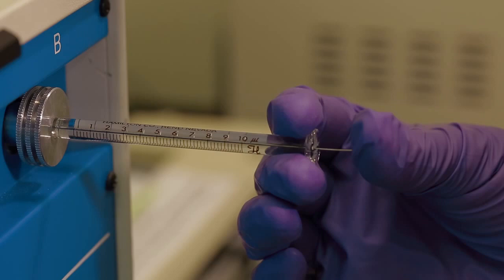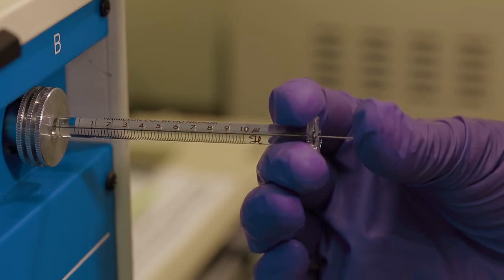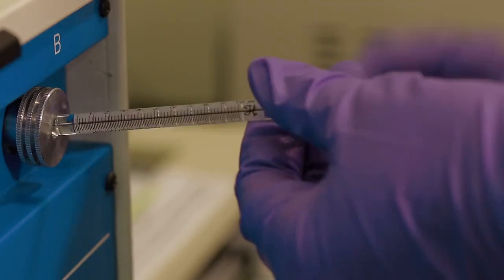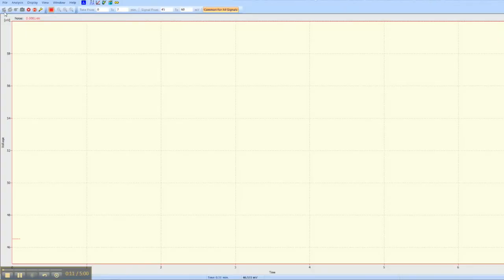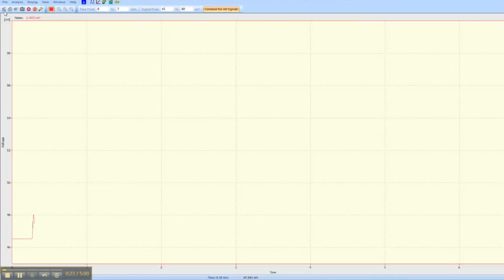When you inject your sample, make sure to promptly plunge the syringe without bending it. It is necessary to ensure that the entirety of the sample is injected at one time. Be patient since it may take a few minutes for the first peak to show.